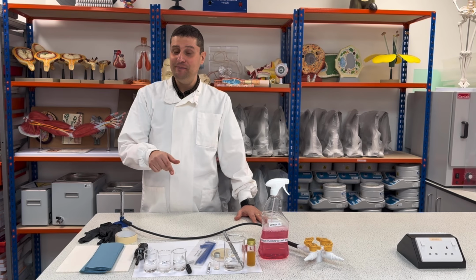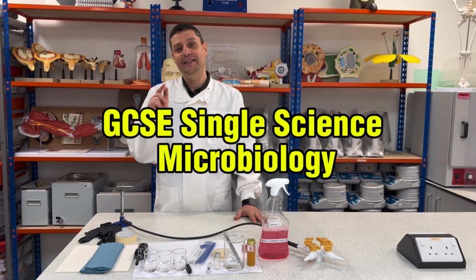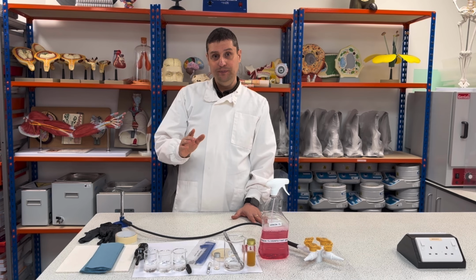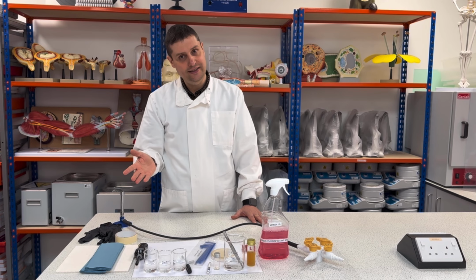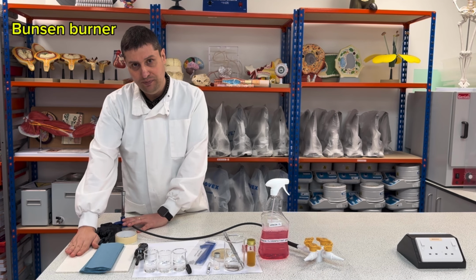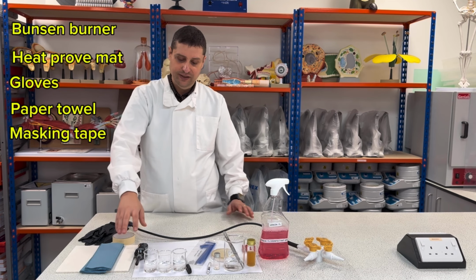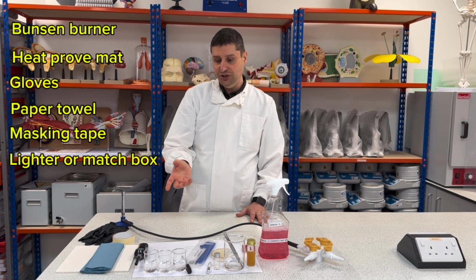In this video, I will be talking about the GCSE single science for biology, microbiology. Okay, so that is the material involved in this lesson. You need a Bunsen burner and heat-proof mat, gloves, paper, masking tape, a lighter, or a box of matches.